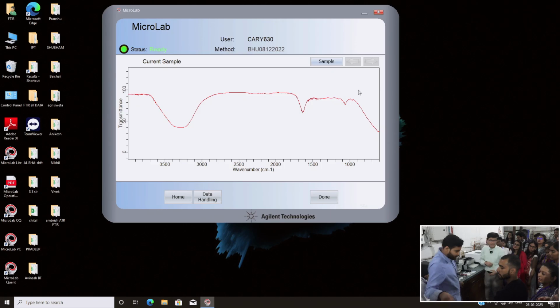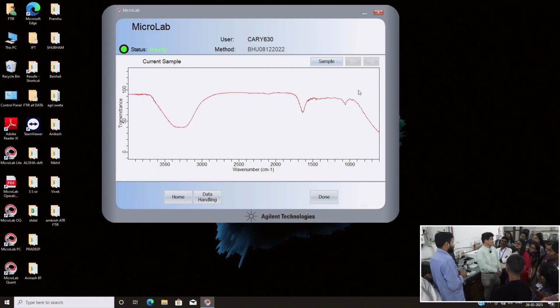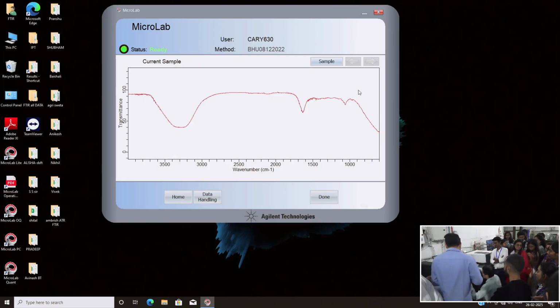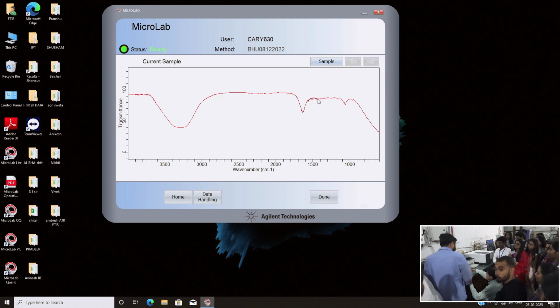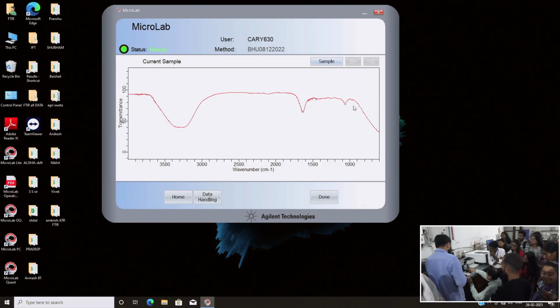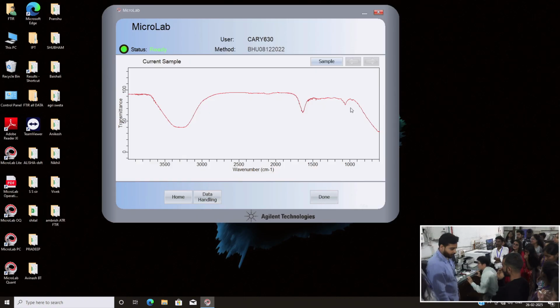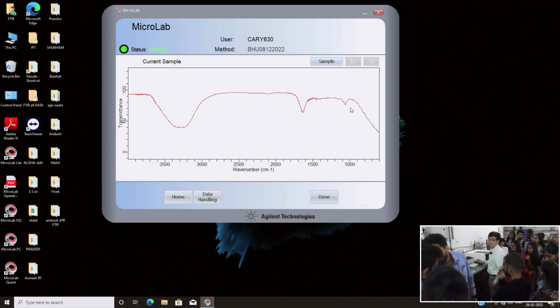Excuse me, it was the measurement of the sucrose solution already. So we should find some peaks of sucrose here. Okay, and this is an apparently small peak. So we need a careful measurement. Okay, so would you measure?